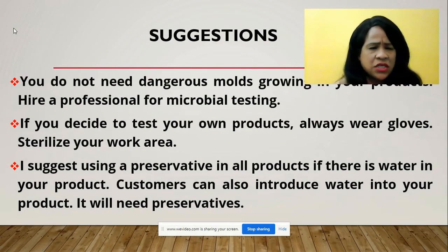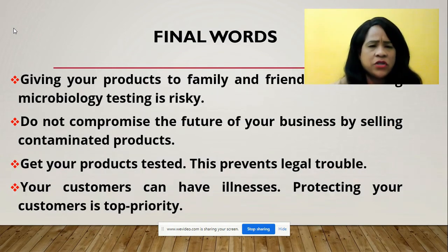Some more suggestions. You do not need dangerous mold growing in your products. Hire a professional for microbial testing. If you decide to test your own products, always wear gloves and sterilize your work area. I suggest using a preservative in all products if there is water in your product. Customers can also introduce water into your product, and that product would then need preservatives.